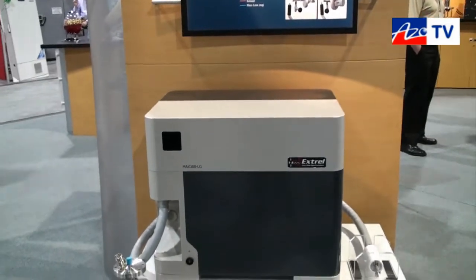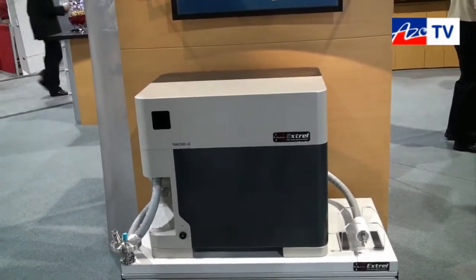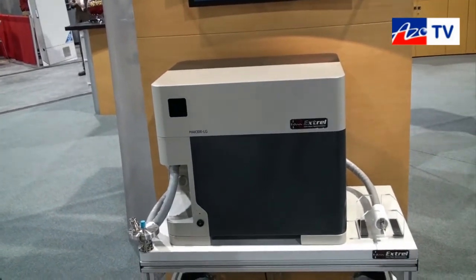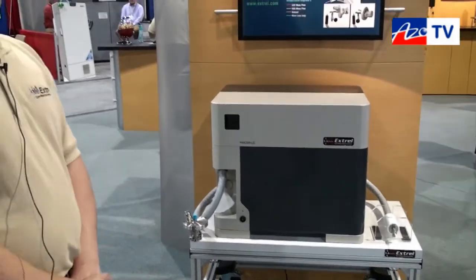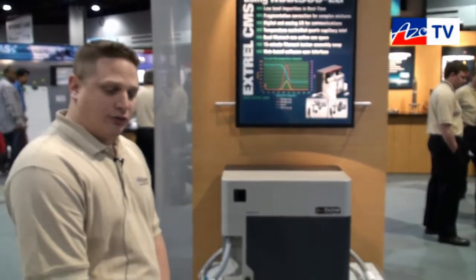The Max 300 LG can be self-fitting so it interfaces with all major OEM TGA instruments. Yes, at this time the standard design with the inlet option allows you to do that, and we also can provide different types of retrofit options.